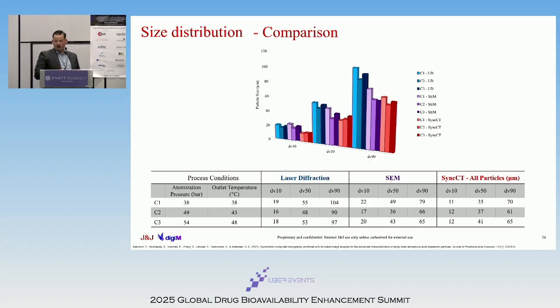But one interesting thing that you can see here is even with the 2D SEM, there's some context that can be lost when you don't have that third dimension. But when we get into the Synchrotron CT data and we truly break these particles down, it actually changes the rank order of some of these. So it can pretty significantly change our understanding of this bed of particles.